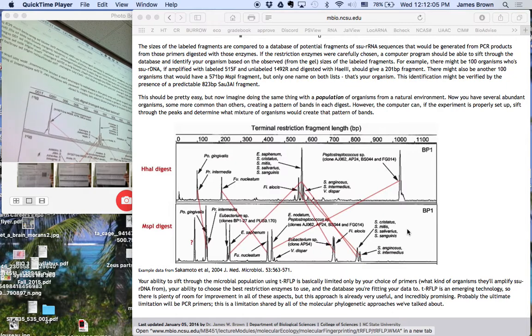And so this is from dental plaque, and you have Porphyromonas gingivalis, Prevotella intermedia, Fusobacterium, some streptococci, Peptostreptococcus, all the standard issue sorts of organisms you would expect in dental plaque. So you take a population of sequences from some sample, and then the computer will tell you they recognize that pattern of groups of sequences.